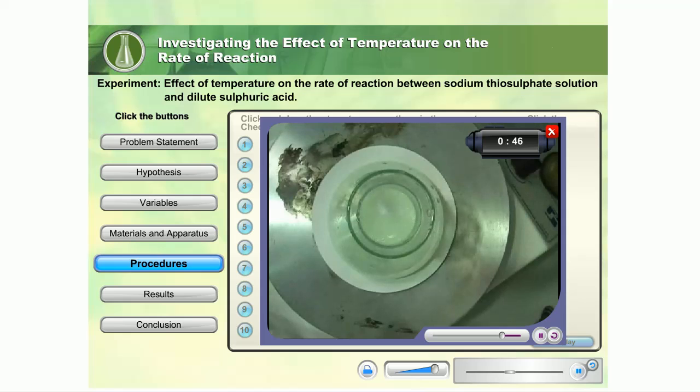View the X from above and stop the stopwatch as soon as the X cannot be seen. Record the time taken for this process to occur.